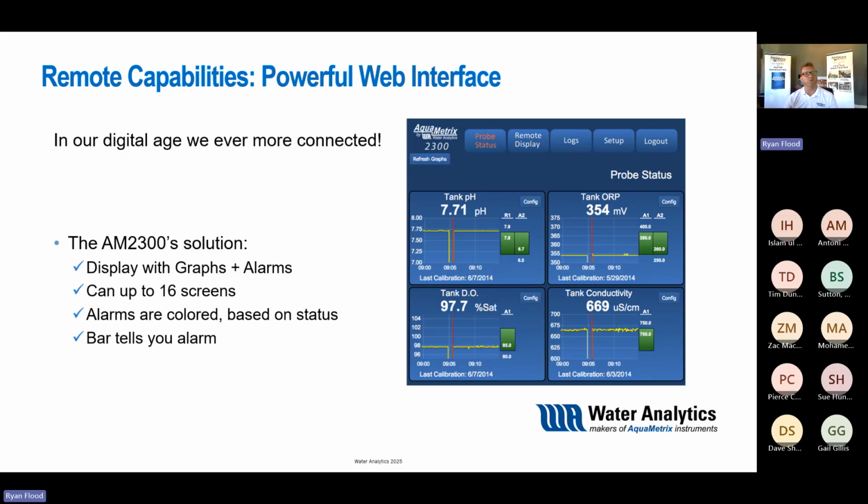So again, as we talk about local control, being able to see it is really good. But if you have a person that's sitting inside a control room or a person that is remote, having that information that the pH value is low and that action is needed, if I didn't set up a control and manual action is required, remote capabilities can be really critical to get there in time so you don't have an issue. And I'm sure a lot of you have experienced losses in either your facility or in some of your customers' facilities, right? We'll use an example in an aquaculture facility. If the pH were to drop to 4, those fish are going to die. And that's something they would need to correct right away to make sure that those fish can survive.